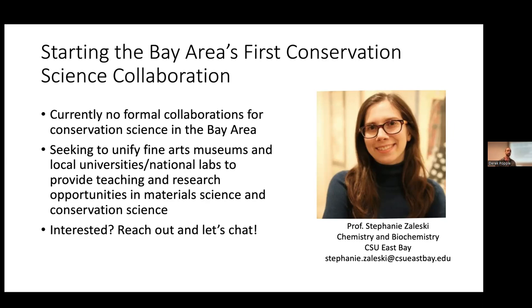And then the second question is, the abstract image had paintings in it. Have we actually looked at any paintings? Not yet, but that's the ultimate goal. Right now, we've just been looking at reference materials. And in the next couple sessions, we're hopefully going to load some paint fragments into the microscope and see what we can find.